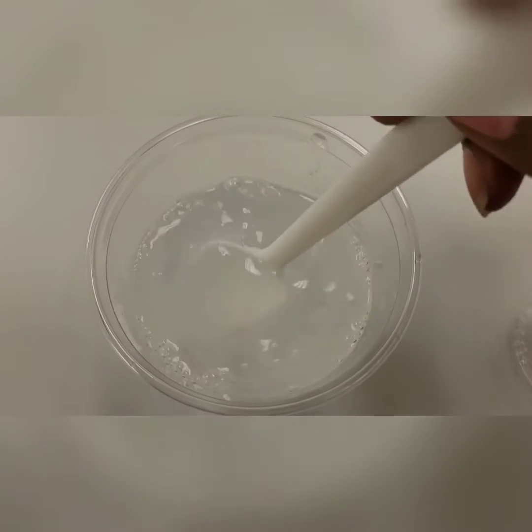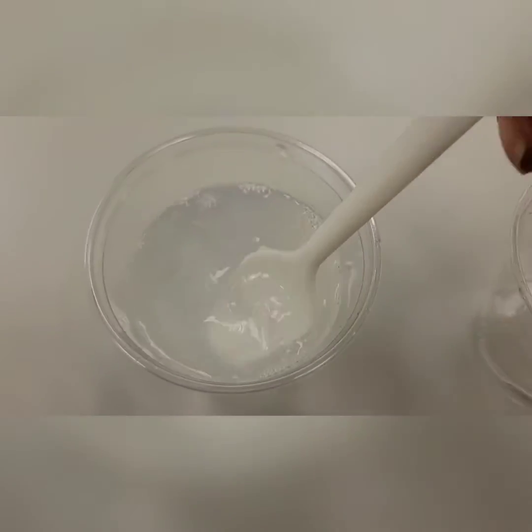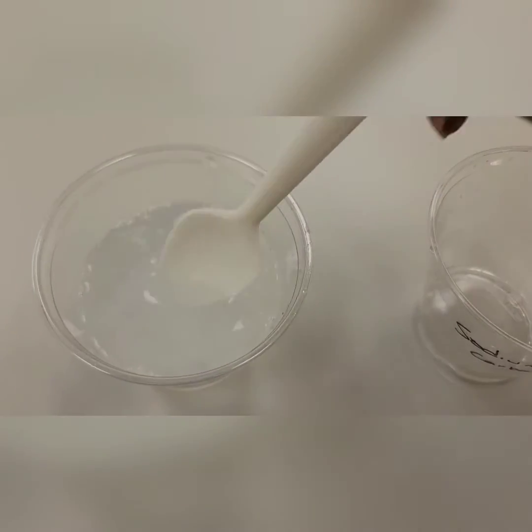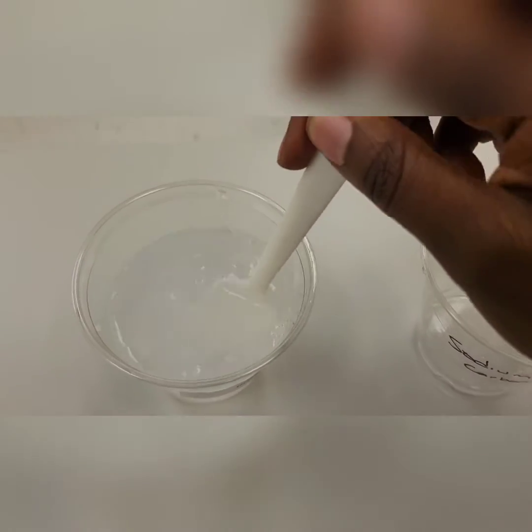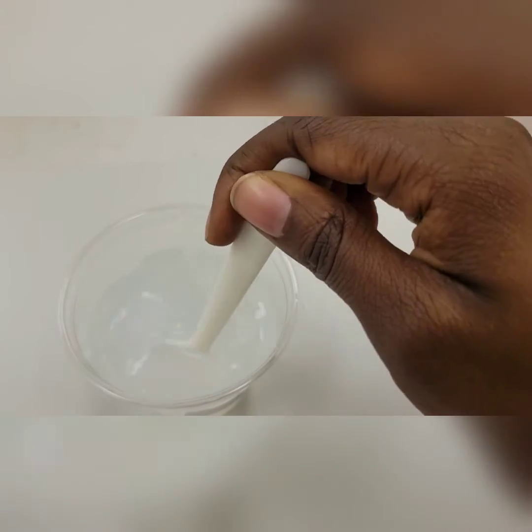So it looks a bit like jelly at this point in time. And I am just going to keep stirring those two substances so that everything is thoroughly mixed.